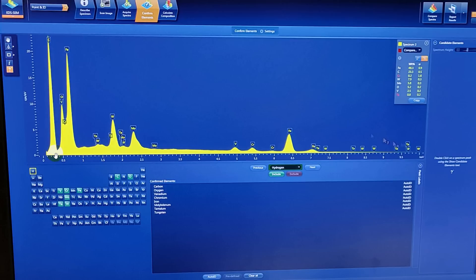In this particular case we've identified a bunch of things: carbon, oxygen, vanadium, chromium, molybdenum, tungsten. These are all things that we would expect to see. The tool steel should have carbon, chromium, tungsten, molybdenum, vanadium, and cobalt, and we see most of those here. One thing that is really strange about this particular sample is there's way too much carbon. It's saying there's more carbon in the surface than iron, and that's probably because this part of the sample is contaminated. It's probably contaminated with cutting oil, which is primarily a mineral oil, which is a hydrocarbon. And so it's probably reading carbon from the oil that's on the sample.